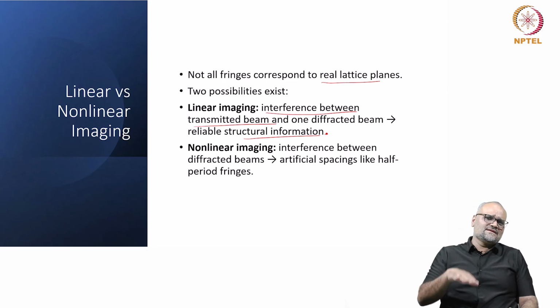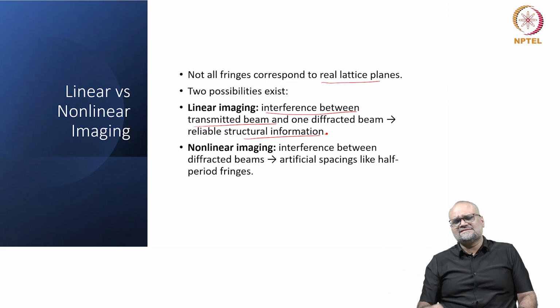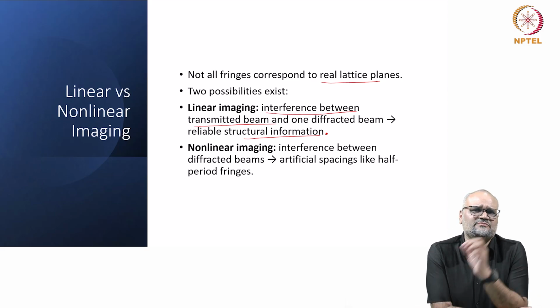I record a focus series, change the focus in the simulations as well, check if there is a one-to-one correspondence, or iteratively repeat and then do a reconstruction of the actual positions of the atoms.